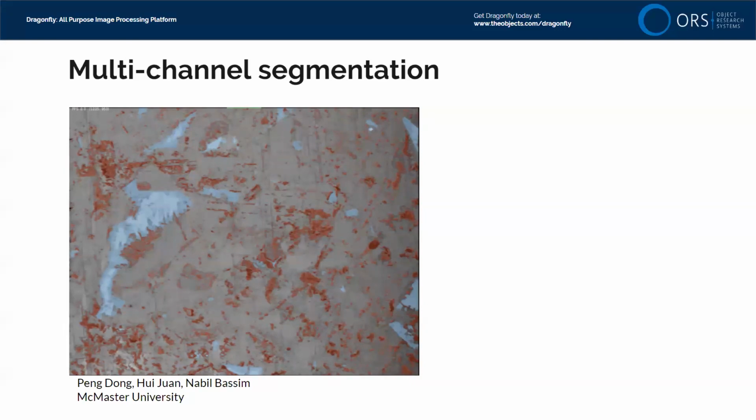the different phases in the presence of those artifacts, but how we can benefit from having two channels of input, in this case, the secondary electron signal and the backscatter signal. You could also add information to your data set.